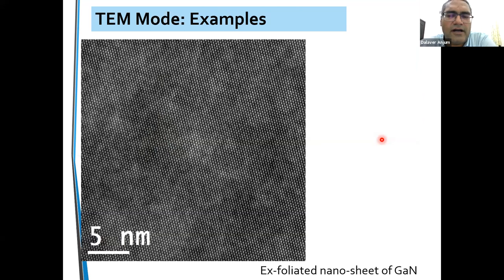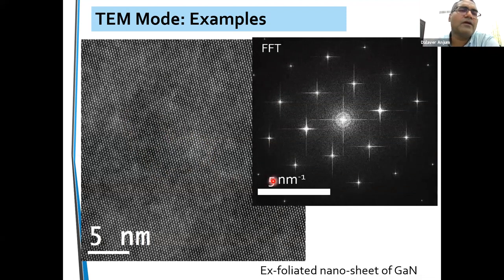And here's another image of a single crystal, a phase contrast image. It's a gallium nitride crystal looked at from the top, magnified enough that we see the atoms of gallium nitride and the space between them. We can take a very nice image of the gallium nitride lattice using the electron microscope. And by taking the Fourier transform of that image, we can come up with information about the crystal structure and many other things. You can do the same analysis on this one as well, but we are so much more familiar with the diffraction pattern coming from X-ray diffraction that this analysis becomes easy for us.